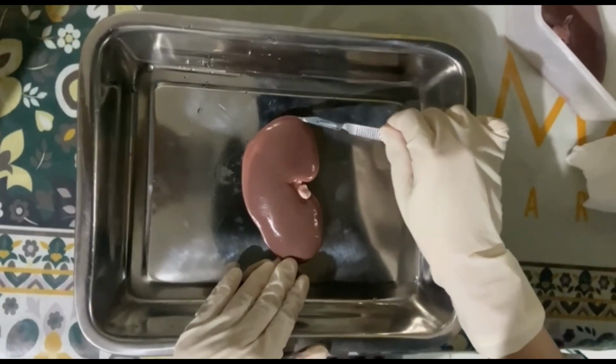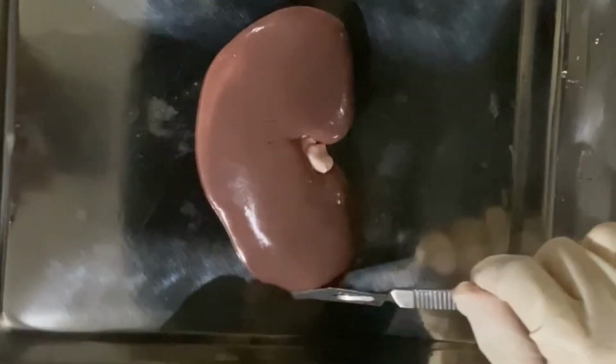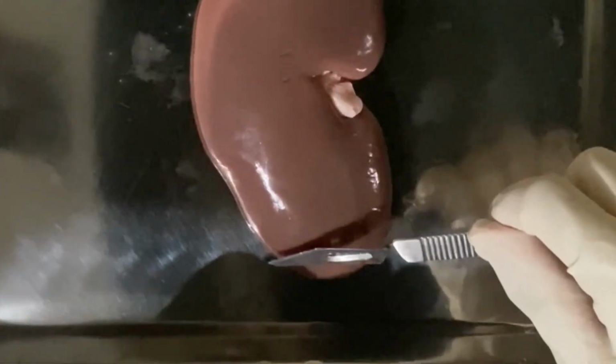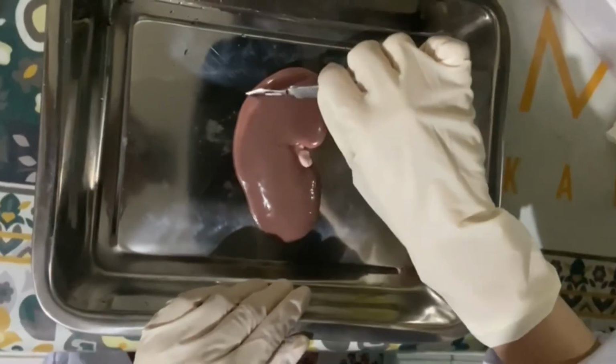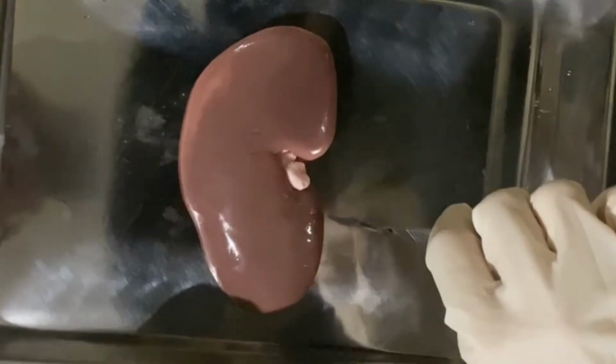The upper part is the superior pole. This is the inferior pole. The lateral margin and the medial margin.